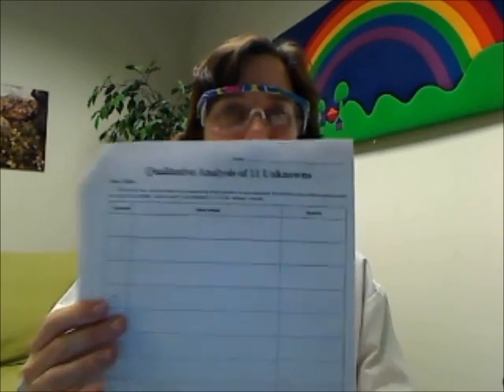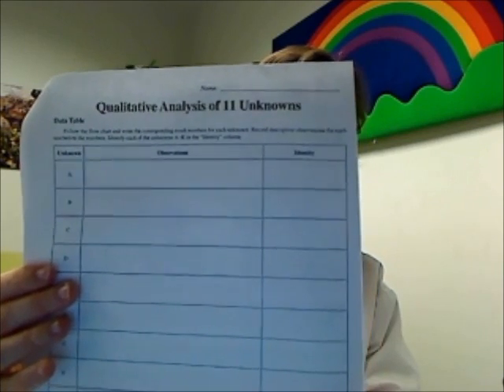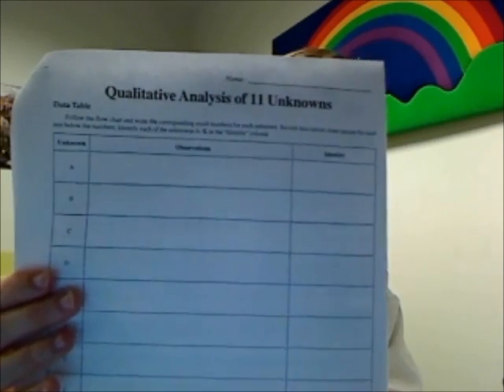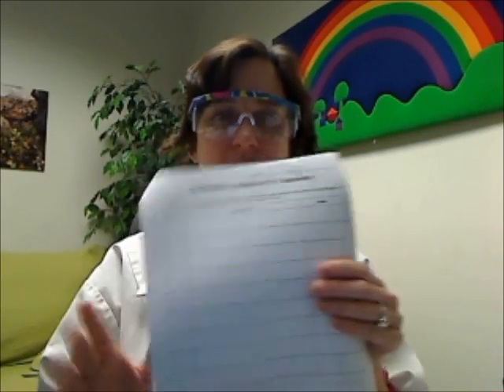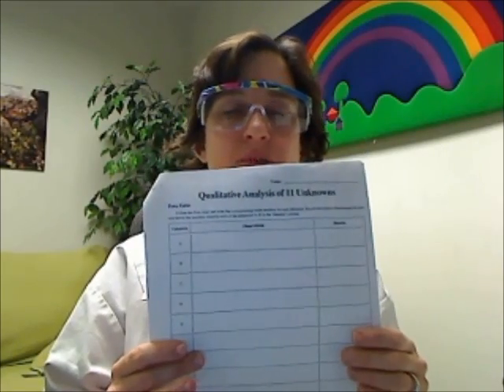How do you record your data? Well, on this sheet here is the data table, and it'll ask you for your observations after each one, A, B, C, D. Notice that J is crossed out there. Every time you do a test and you notice something about C, that C did this or C did that, write it down as an observation, and ultimately you should be able to identify all of them here.